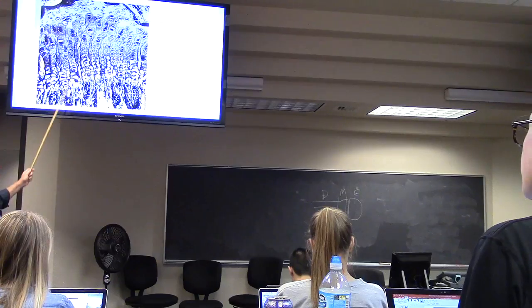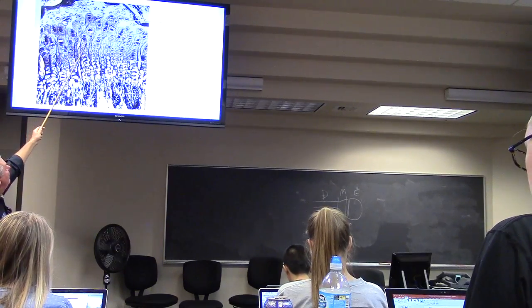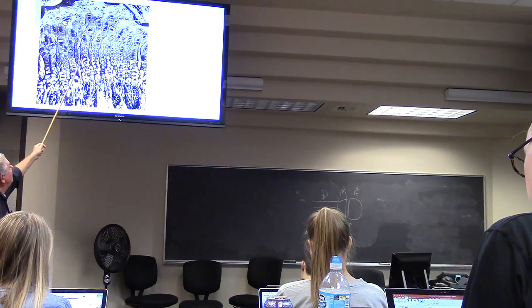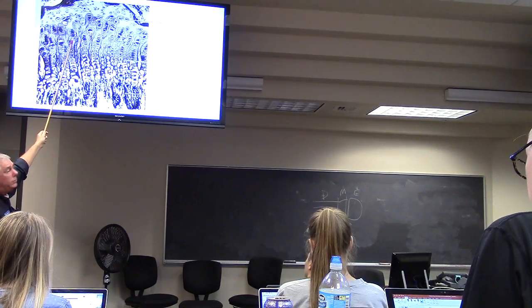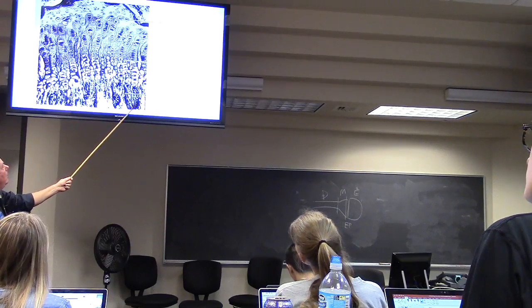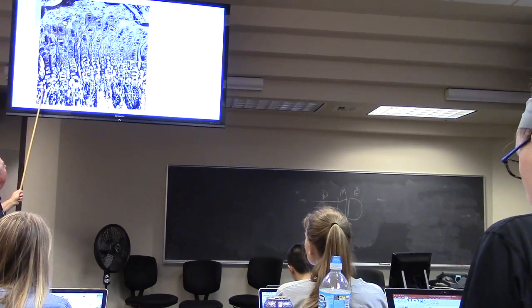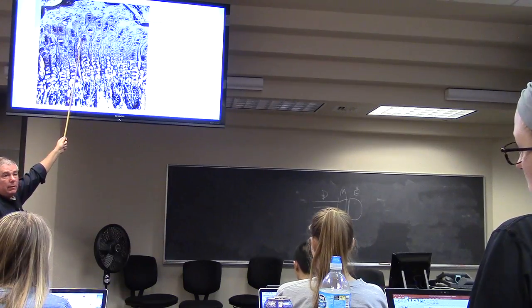This is what it looks like. There's the reserve zone up there, proliferative and hypertrophic zones here, and now this is where you start seeing the transition from hyaline cartilage to bone. This stuff is eating the cartilage in that direction.